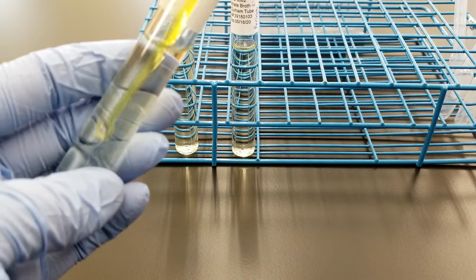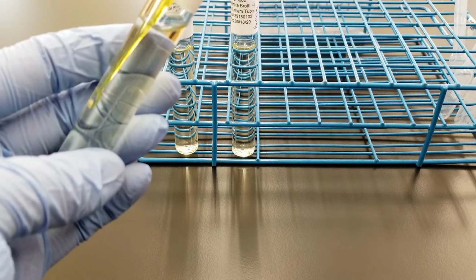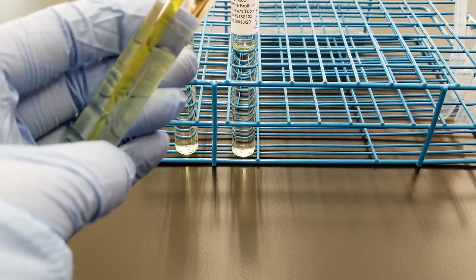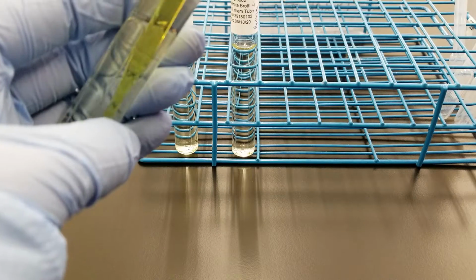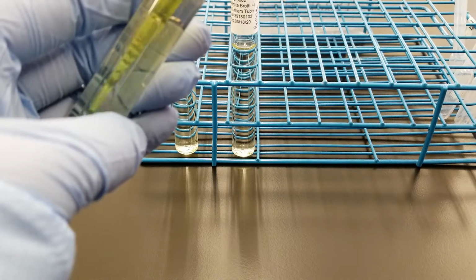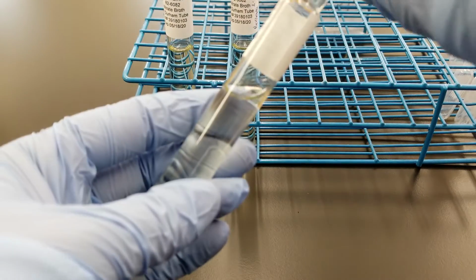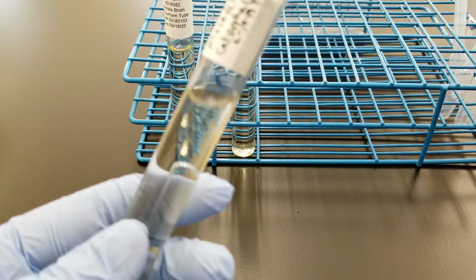Okay. This is going to end up being loosely capped and put in a non-CO2 incubator for 24 to 48 hours. Some organisms may actually require up to a week in incubation in order to get the results that are expected in the nitrate reduction test. But we're just going to do it for 48. Okay, so see that I tightened it all the way, and then I did it loosely back. Okay, about a half a turn.